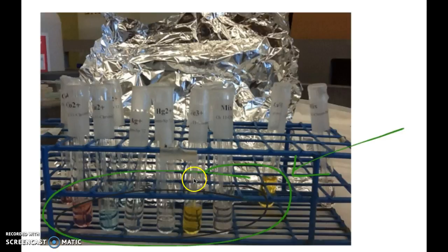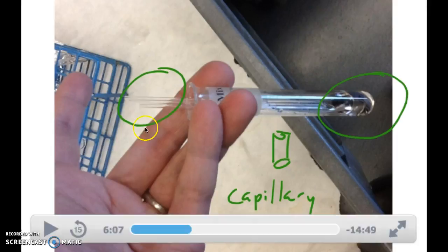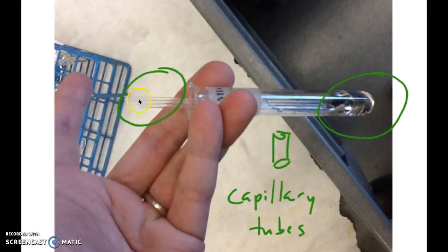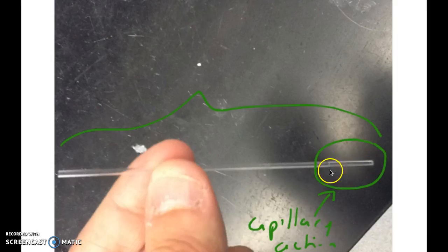Those are the tubes you're going to use, glass tubes you're going to use to actually spot your sample onto the paper. Here's what it looks like. The capillary tube is these guys right here. They're inside the actual test tube. When you take them out and hold them, you see that there's some solution inside the capillary tube already. That's because of capillary action by water. So it climbs up a little bit into the glass.